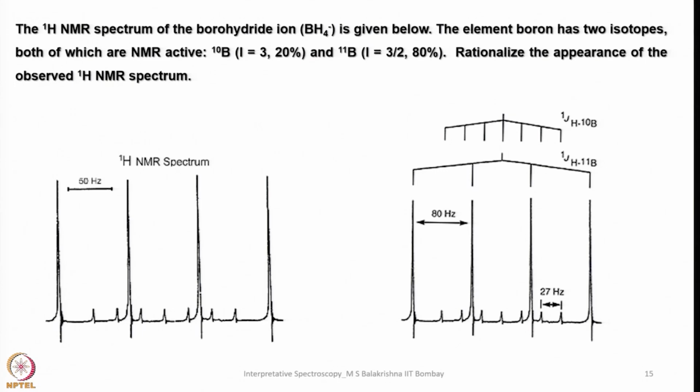So let me stop here and continue in my next lecture with more interesting examples with emphasis on boron, mercury, and even including 19F NMR spectra of some of these mixed NMR nuclei compounds.